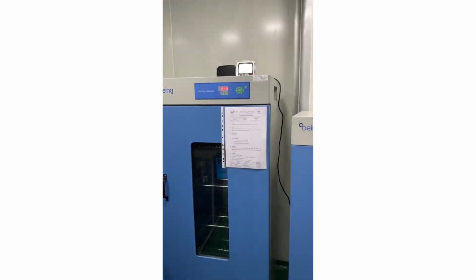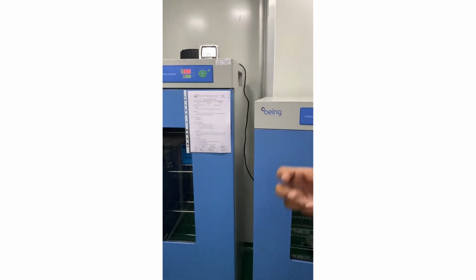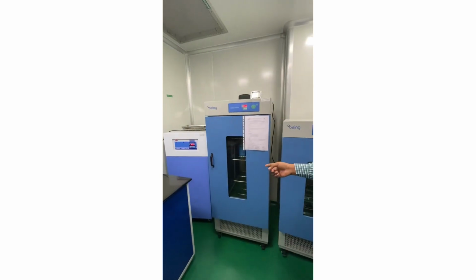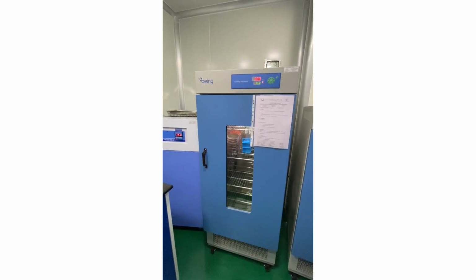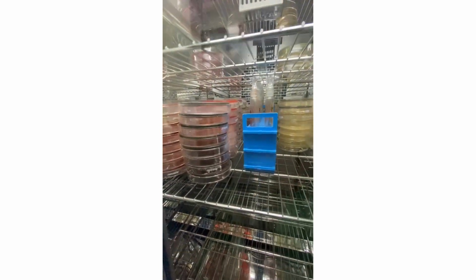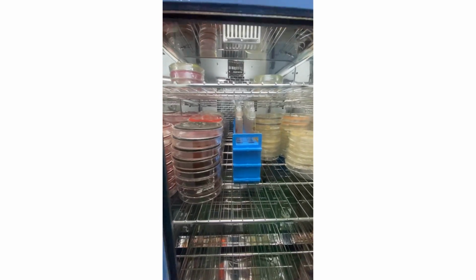The samples we are getting now, like iPulse or iCare and also coffee black, those samples we are mixing, performing, and keeping in that incubator for 48 to 72 hours. These are IPL samples and coffee samples.